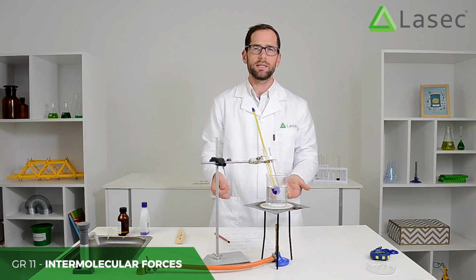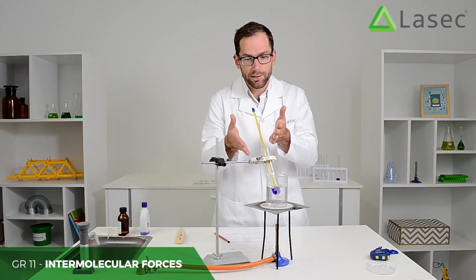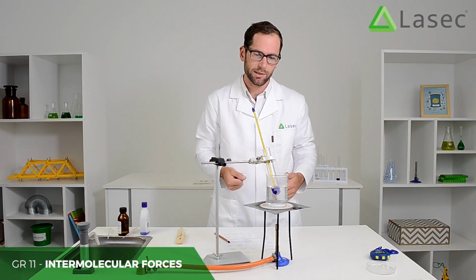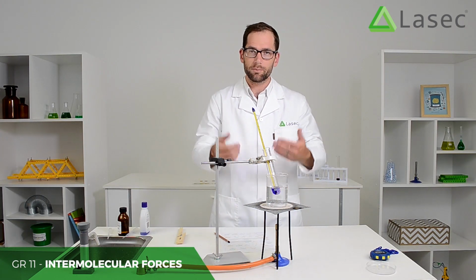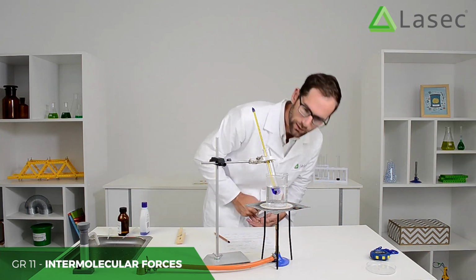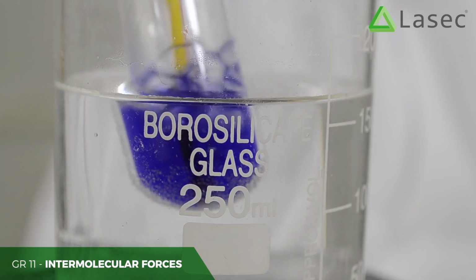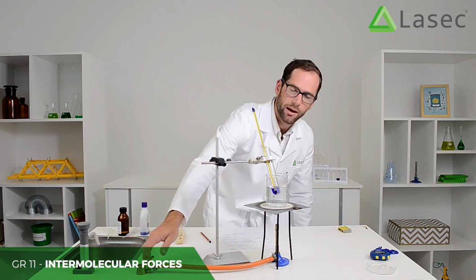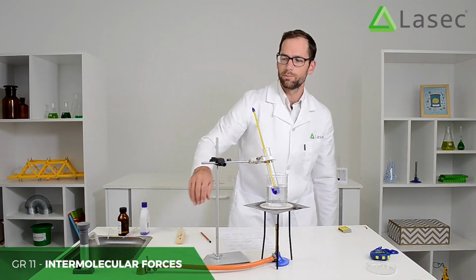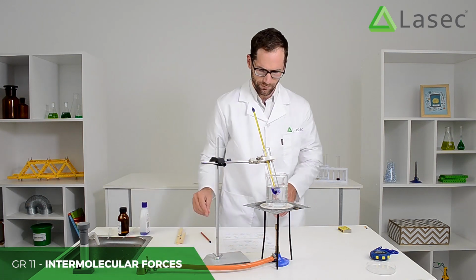When I want to see if the nail polish remover is boiling, I don't want to lean right over and look down the length of the test tube, because then I'm getting those fumes right in my face. I can come to the side and view it from the side. And there we have my nail polish remover. It's starting to boil at just over 75 degrees Celsius.